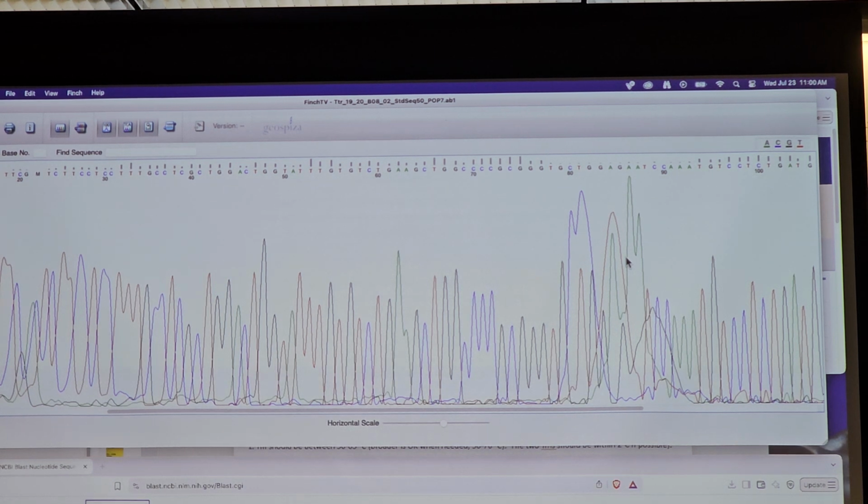But if you're going to publish the sequence of the gene, you definitely want to be 100% certain you've got the right sequence. If you don't want to be corrected later, that's embarrassing. It used to be, before sequencing got so good, that people put things into the databases all the time that had a few errors, and then over time they got fixed. People were contacted and told, your sequence is a little wrong here, and then they could go back in and fix it.